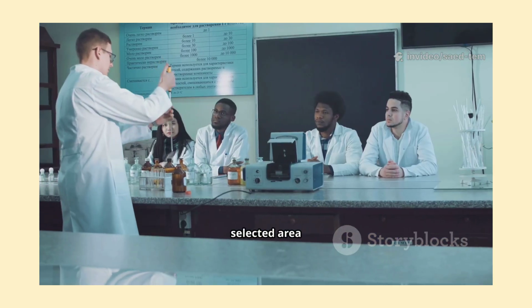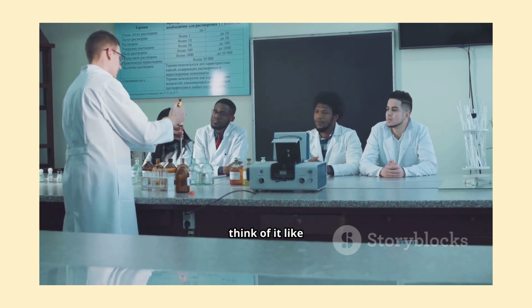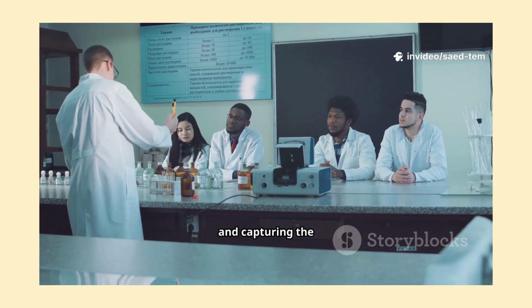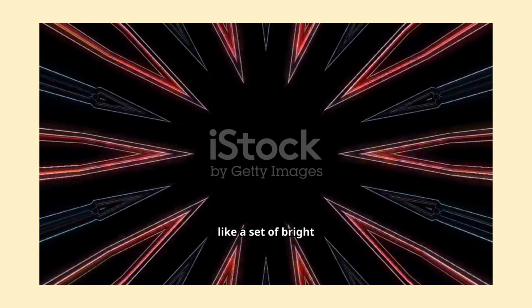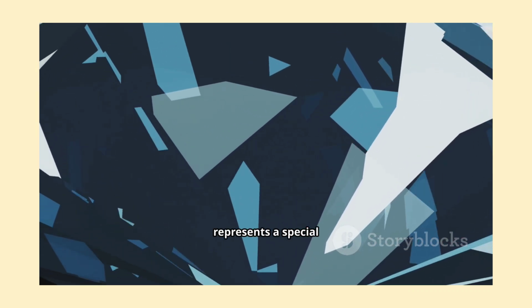To interpret selected area electron diffraction, SAED, as an undergraduate, think of it like shining a very thin, powerful beam of electrons through a tiny spot on your sample using a TEM, and capturing the pattern these electrons make after bouncing off the atomic layers. The result looks like a set of bright spots or rings on a screen. Each spot or ring represents a special way that atoms are stacked in the material.